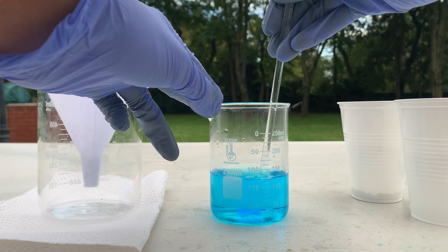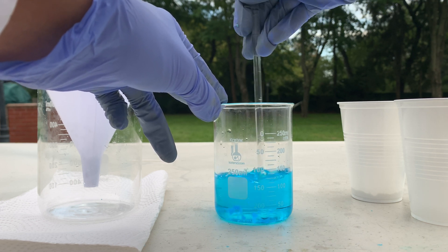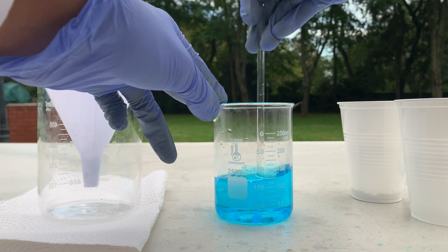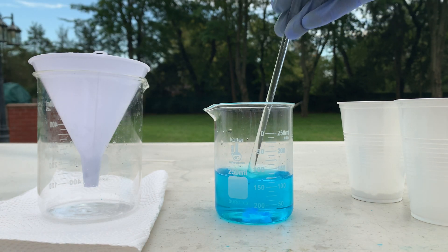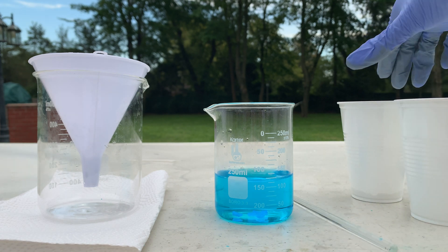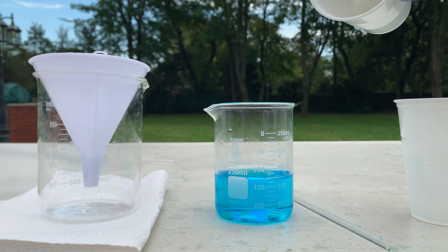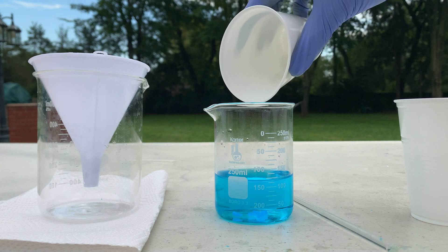There are still some tiny bits at the bottom that I'm trying to dissolve. I'm going to slowly add the sodium bicarbonate because it should cause some fizzing of carbon dioxide gas being released, so I'm going to add it slowly.